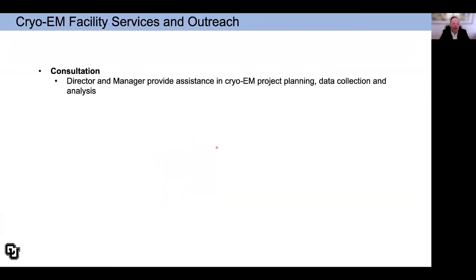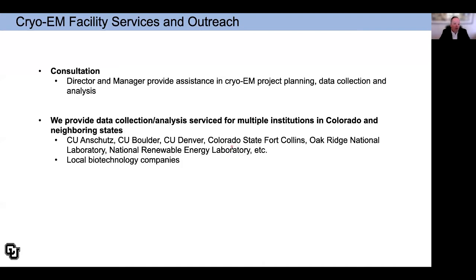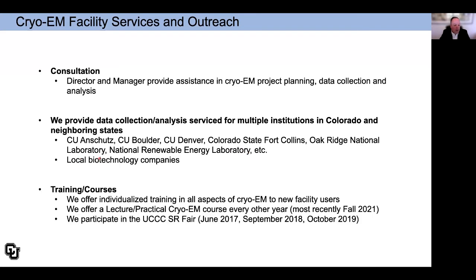What type of services do we offer? So to begin with, we offer consultation services to design and plan CryoEM projects, and we do this mostly through consultations with new users. We also provide data collection and analysis services for multiple institutions in Colorado and neighboring states. And here's just a sampling of some of the places that we have worked with, which include a number of local biotechnology companies.